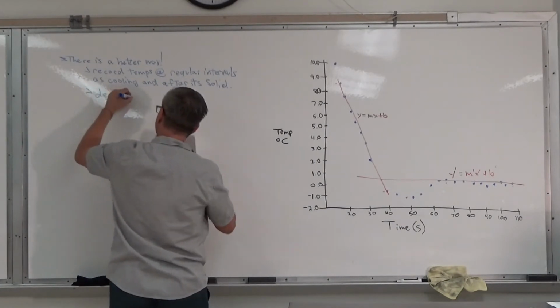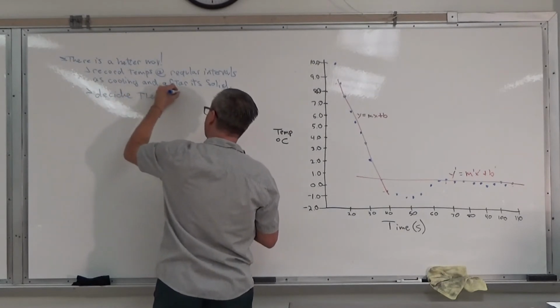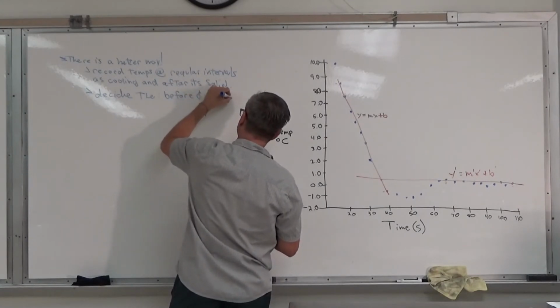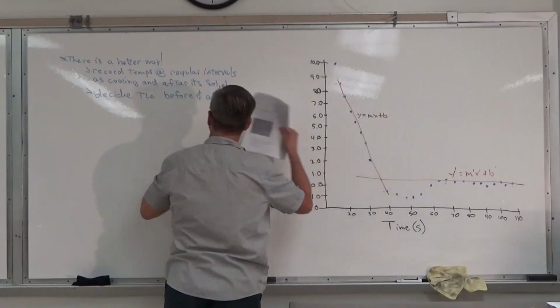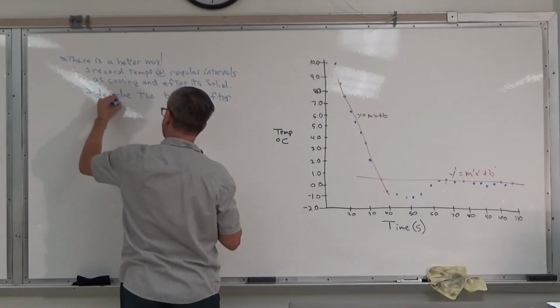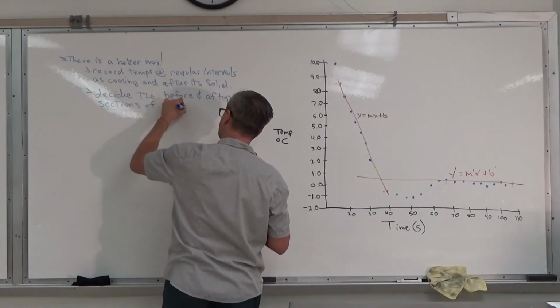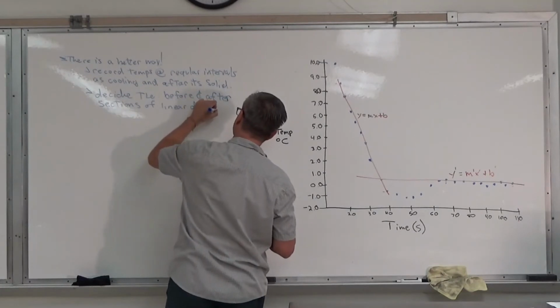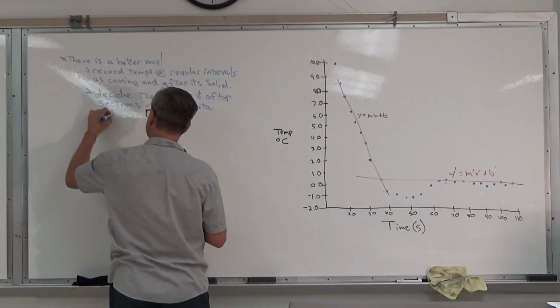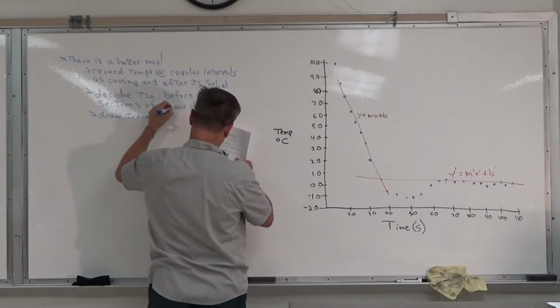Decide the sections of linear data before and after the dipsy-do. Draw a trend line for those sections.